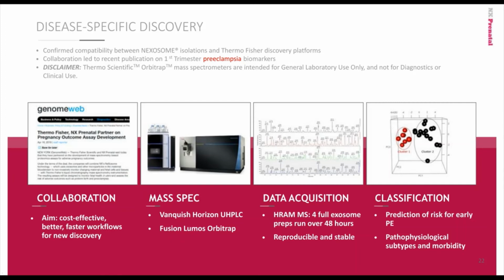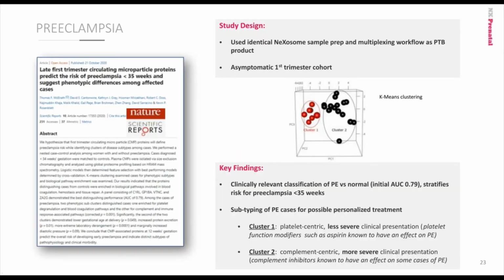I sent those samples, and he fed those into a Vanquish UHPLC coupled to a Fusion Lumos. Dr. McElrath at BWH performed the statistical analyses on about 800 to 900 protein candidates, identified by first creating libraries and then performing the comparative proteomics and using the libraries to confirm IDs.